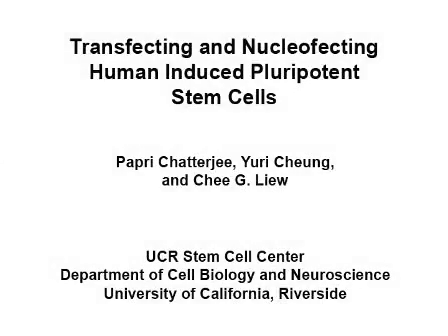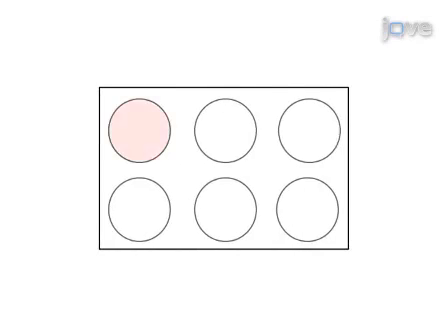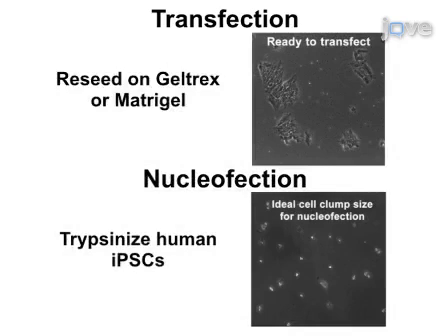The overall aim of this experiment is to achieve high transfection efficiency in human-induced pluripotent stem cells using optimized transfection and nucleofection protocols. This is accomplished by first establishing feeder-free cultures of human-induced pluripotent stem cells. For transfection, the human-induced pluripotent stem cells are plated on Geltrex or Matrigel overnight, while for nucleofection, small cell clumps are obtained by trypsinization.